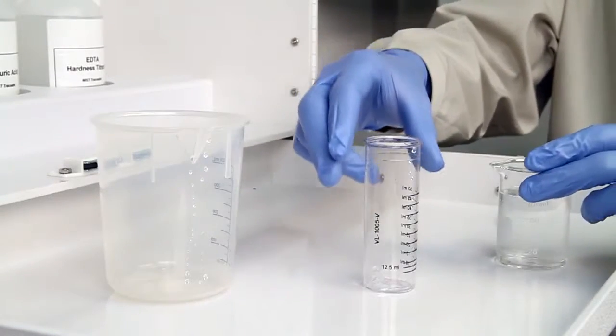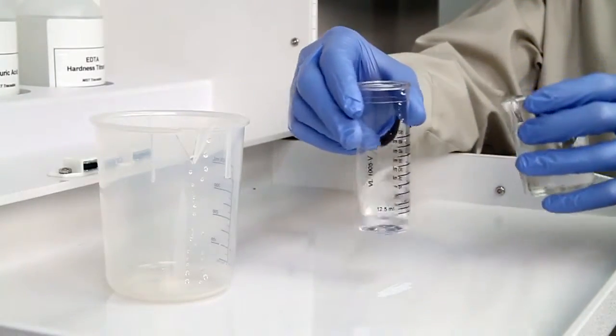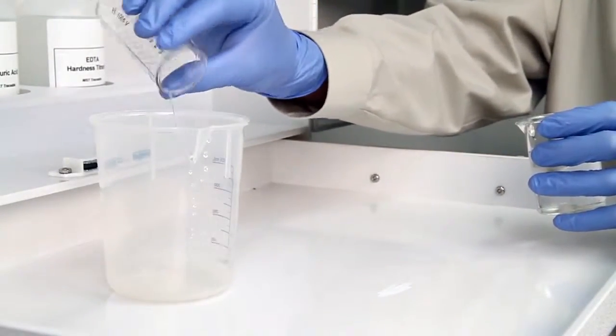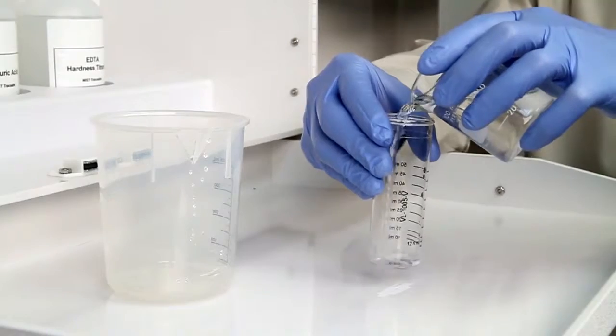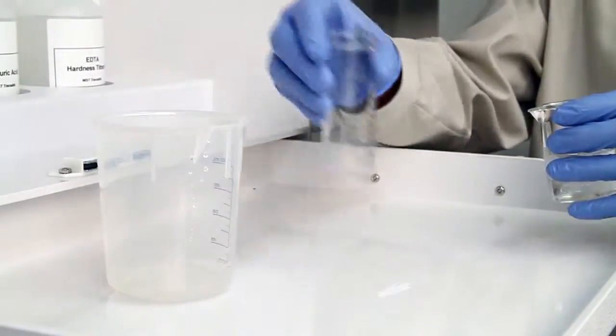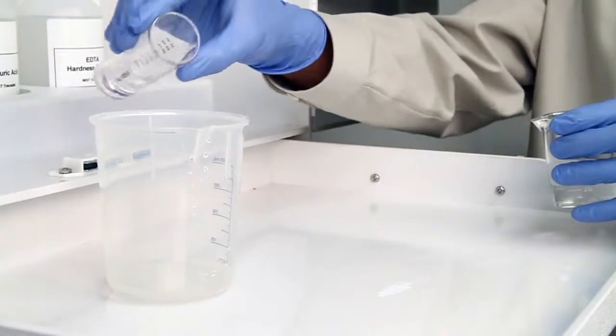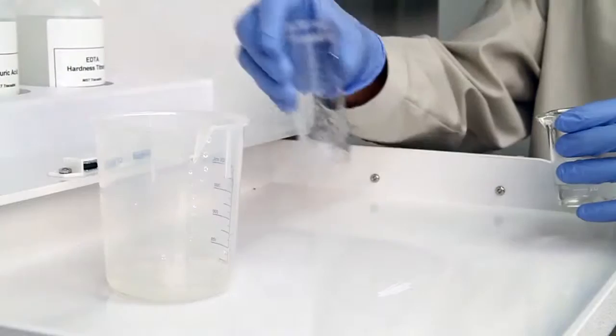The first step is to collect your sample. Before you begin your test, it's important to rinse the vial three times with the sample to be tested. This minimizes the chance of contamination from a previous titration. Hold the vial close to eye level while pouring to ensure you have an accurate sample.